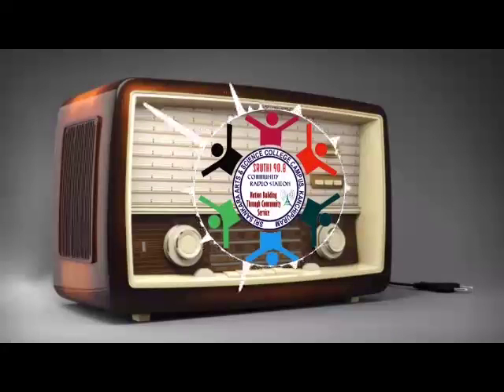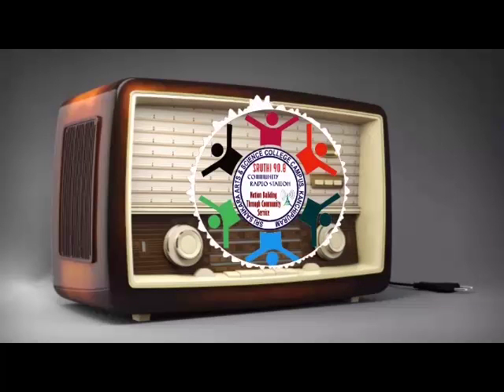Next, cooling jacket. It is filled with cool water. Normally, the activity of microorganisms inside the bioreactor may produce some heat. The heat may affect the process of fermentation and also denature some enzymes which are involved in the fermentation process. That's why we should prevent the rising of heat in the fermentation process. The cooling jacket circulates the cooling water in order to remove heat produced by the microbial activity. After that, the fermentation reaction will come to optimal condition.